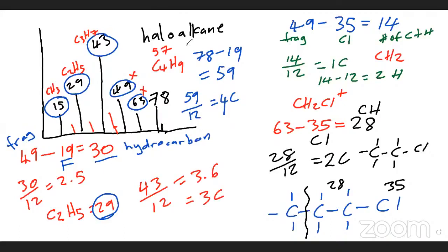So let us label it again. This peak is the M plus one peak. This, the molecular ion peak, is the M plus peak. And this, the tallest peak, is our base peak. But what does the M plus one peak tell us? There's an isotope present, all right.